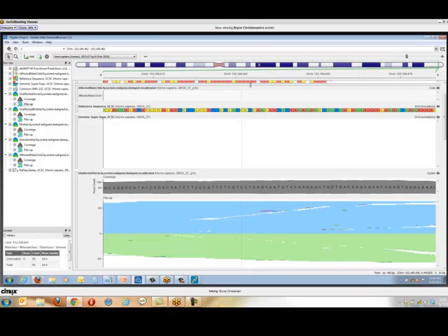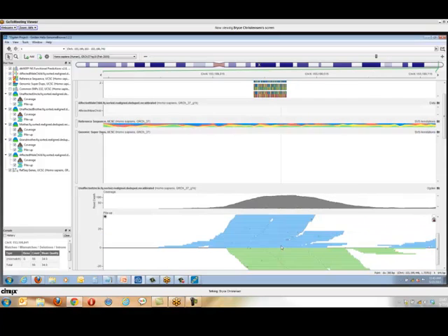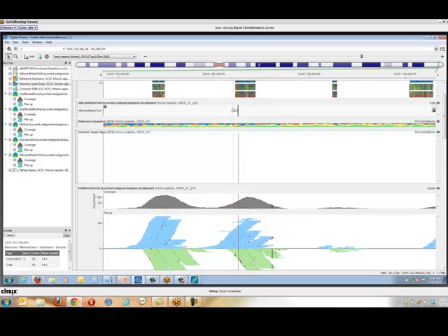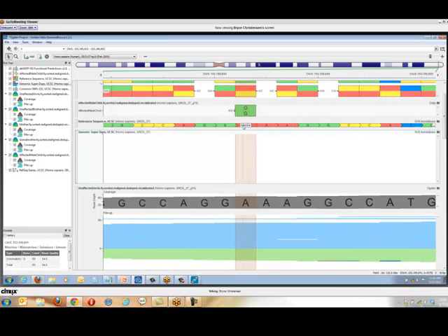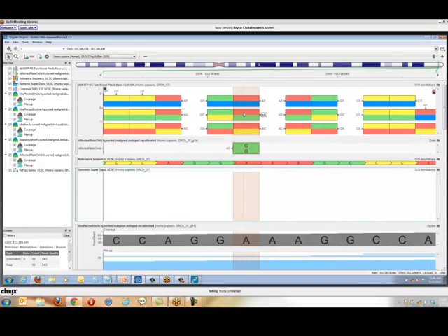If we make that a little bigger, let's go back out. I can't remember where our variant went. We lost it. Okay, it's over here. So zoom right back in around this particular mutation. We can see here in the reference sequence that the reference allele is an A. What we actually have in this sample is a G. And if we click and see what the A to G change is predicted as, this was all pre-curated, pre-calculated.